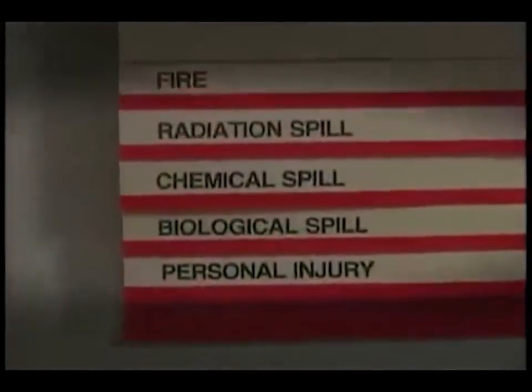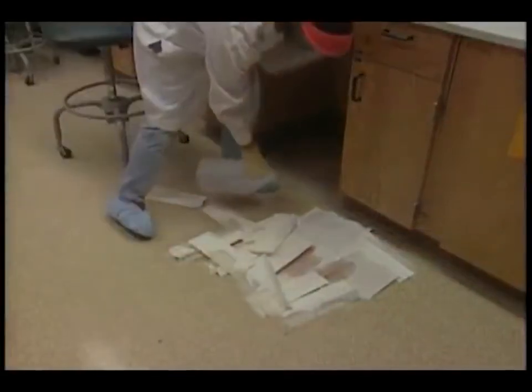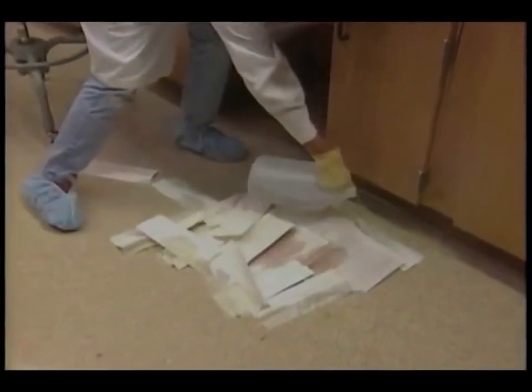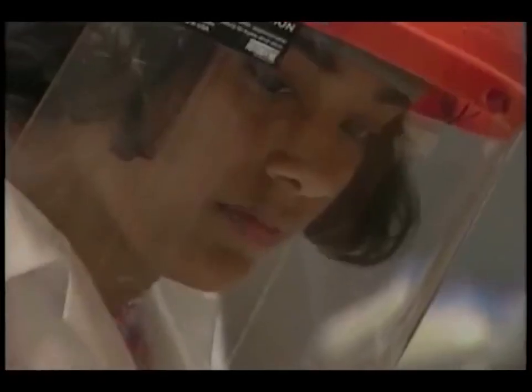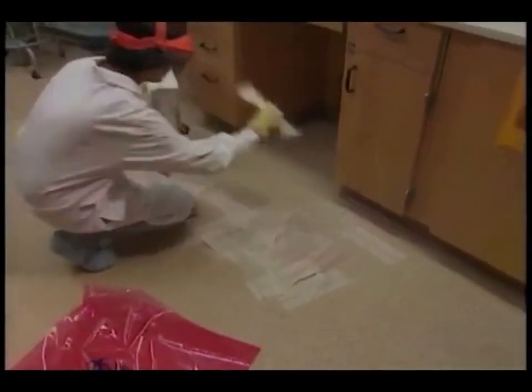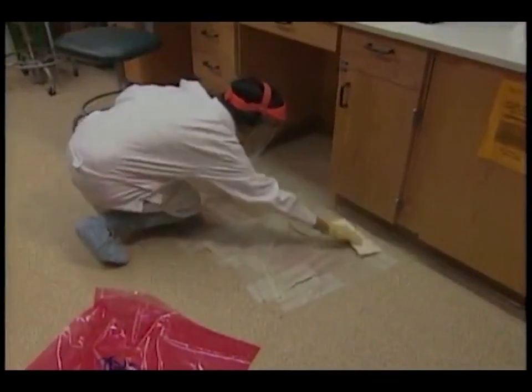And what about a biological spill? A biological spill in a BSL-2 facility can be cleaned up by the laboratory worker using precautions. A 1 in 10 dilution of household bleach will disinfect the area. Allow 20 minutes for the bleach to inactivate infectious materials.